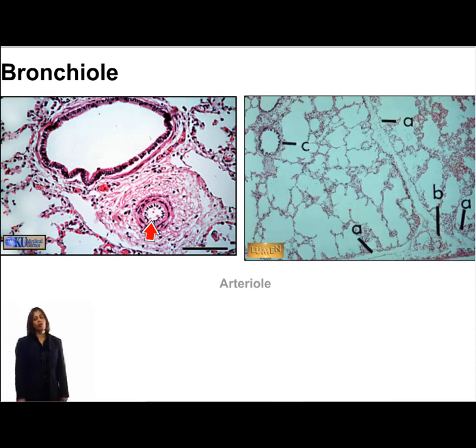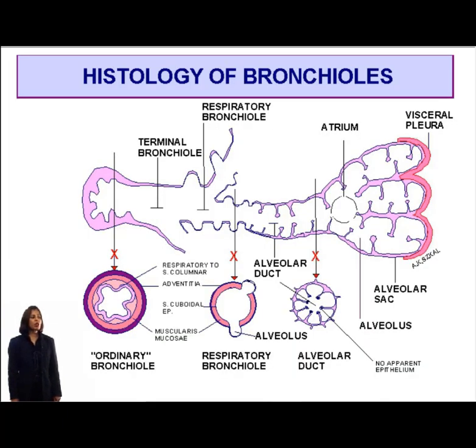From the bronchiole, whether you call it a simple bronchiole or a terminal bronchiole, we will move on to respiratory bronchiole. But before we do that, let's look at how the pattern moves from terminal right up to the alveoli. A terminal bronchiole gives rise to a respiratory bronchiole, and if you notice the alveoli budding off from it, this will tell you that the lumen lining will be interrupted.